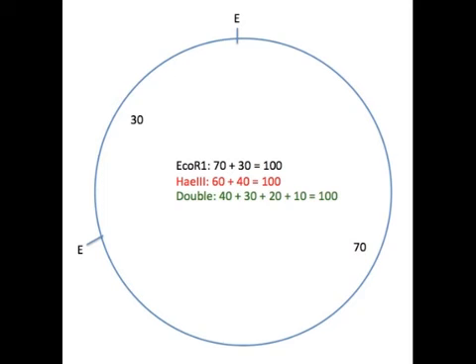So let's make a plasmid map. Start with a circle and pick one enzyme and put its initial site at 12 o'clock. Place the second cut at its correct position based on size. It's arbitrary whether this is the large or small fragment.